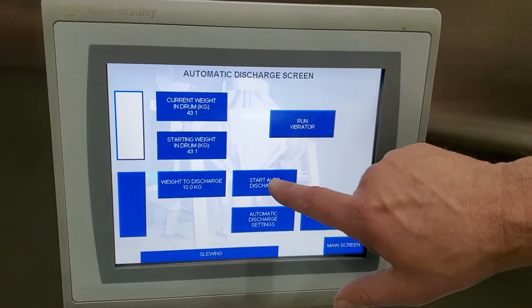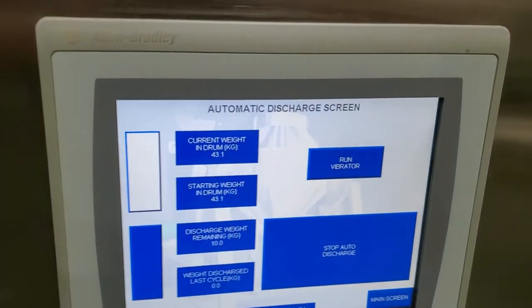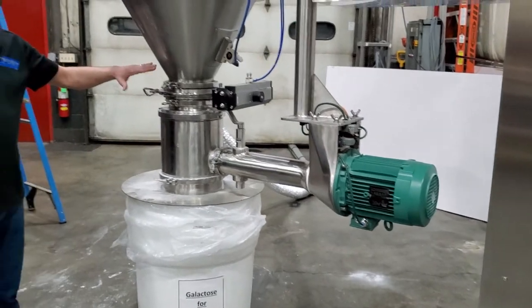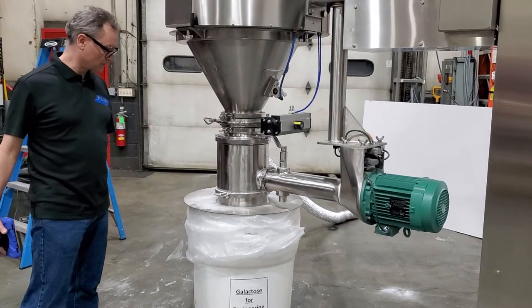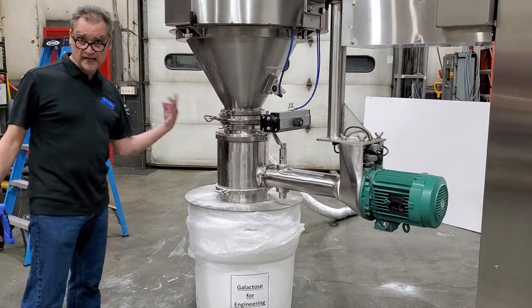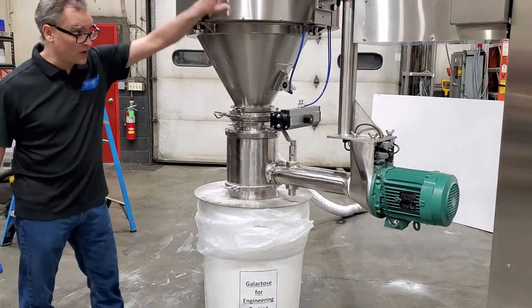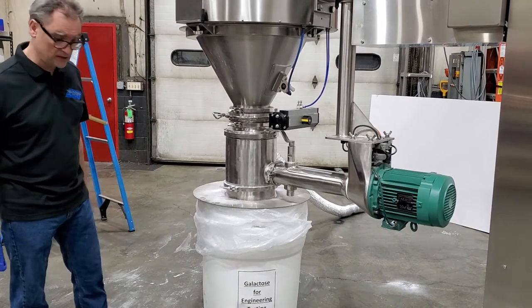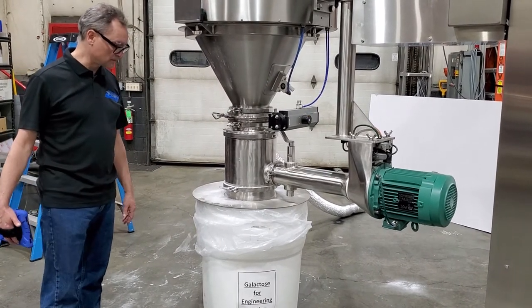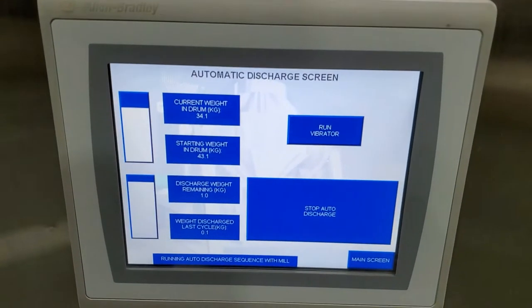So I'll press the start auto discharge. It will start up the mill. It starts up the rotary valve. It's sizing the material directly on the drum — no scale underneath, all the weighing is done in the machine. Now let's slow it down — it's tapering down, going nice and slow for the accurate discharge.